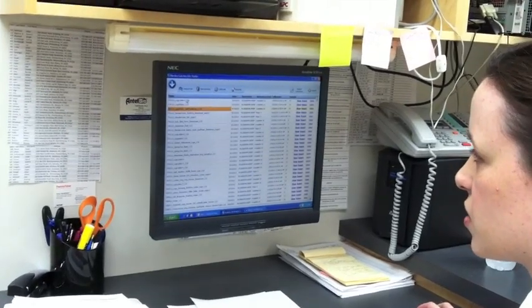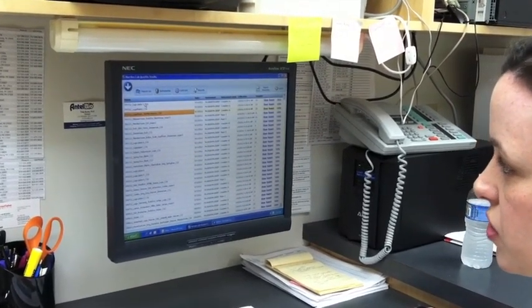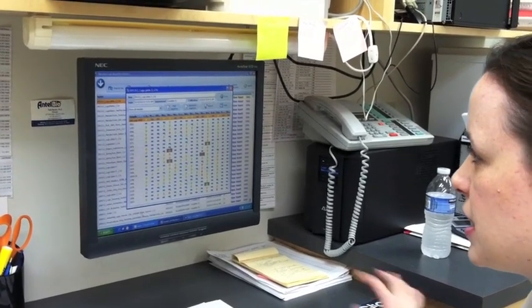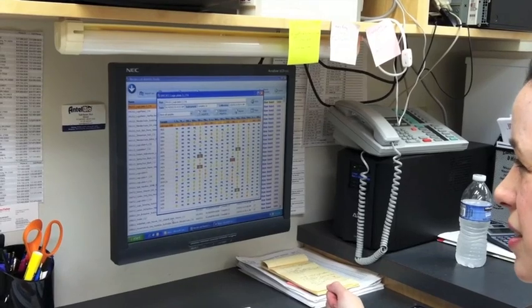This is the software we use to look at the results, see what's positive, and create reports. So this would be a plate I ran earlier — there are 23 samples here. The sample ID is listed down this side, and this is from a complete 16 plate.